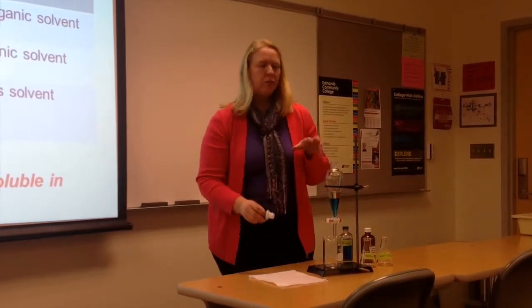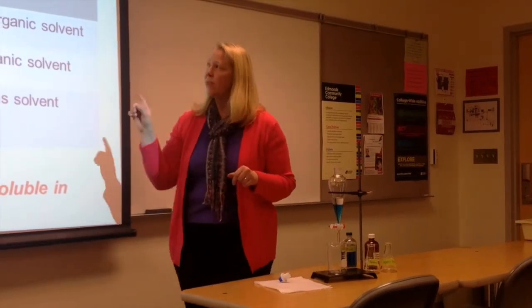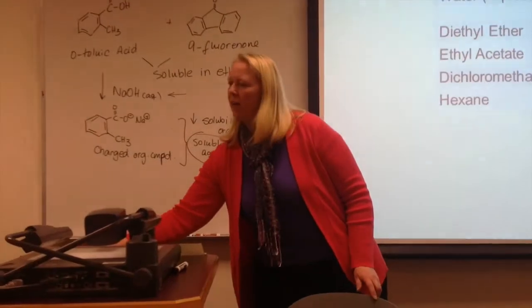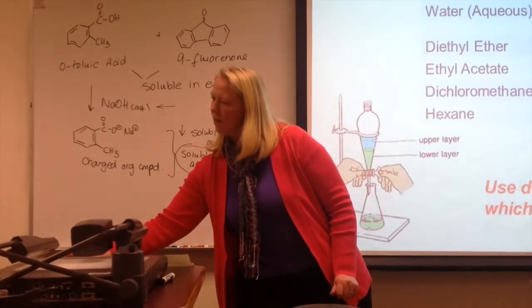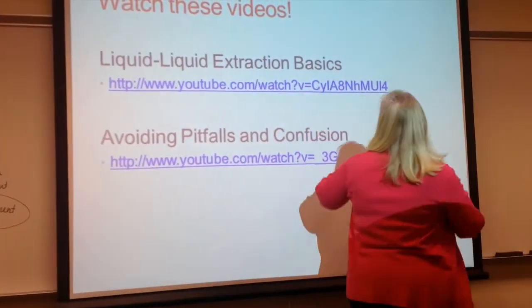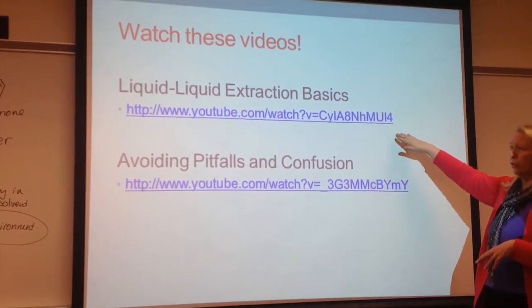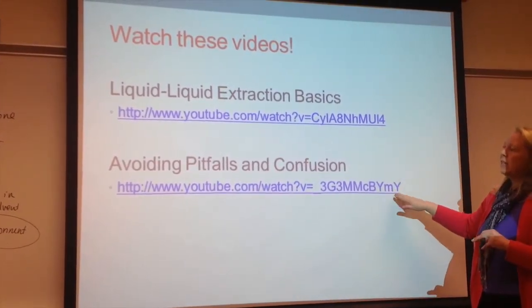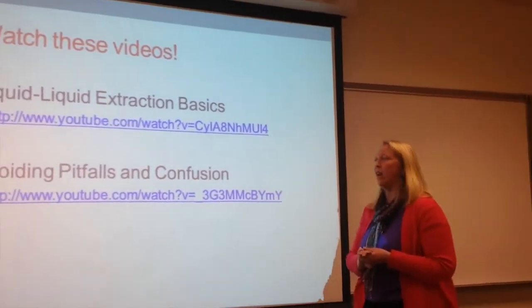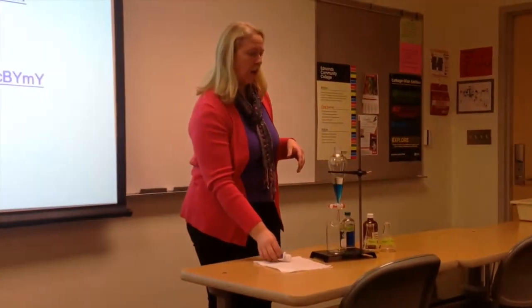So I'm showing you a few things to take into consideration when you're doing this. I did have some videos up on the PowerPoint presentation, which is loaded up on Canvas. So make sure you watch those. The first video gives you some nice basics on the technique and how you do it properly. And then the second video talks a little bit about some of the pitfalls, some of the confusion that can arise from doing extractions. And we just don't have enough time to go over all of those.